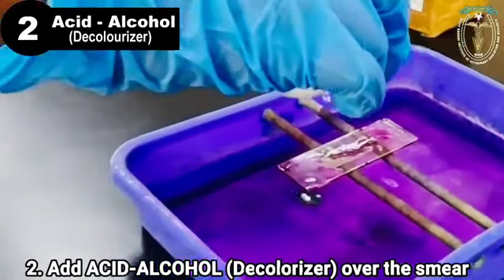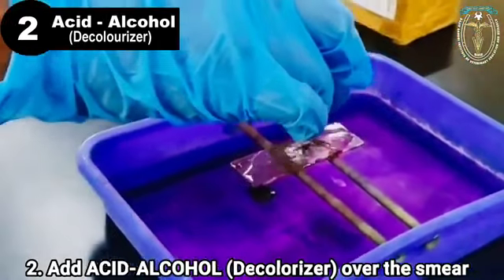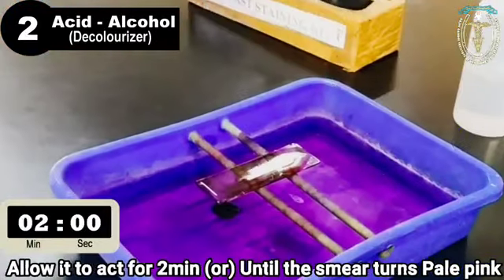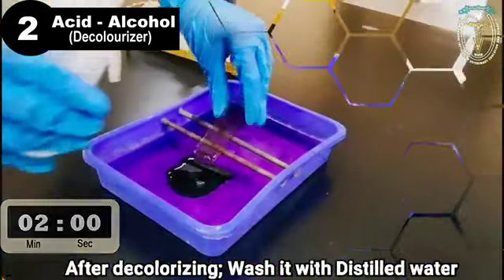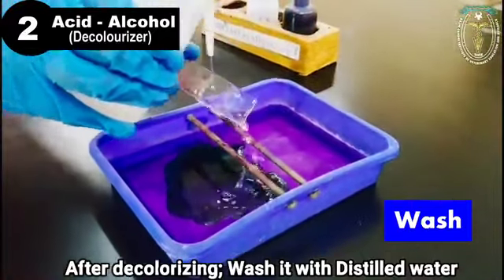Secondly, add the acid alcohol, the decolorizer, over the smear. Cover the entire smear with the acid alcohol, and allow it to act for 2 minutes or until the smear is sufficiently decolorized to pale pink. After 2 minutes, wash it with distilled water.